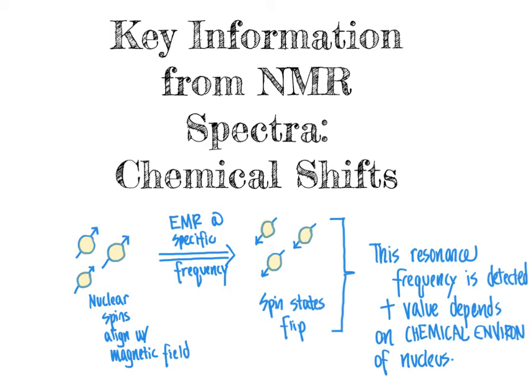In the last video, we introduced the topic of NMR spectroscopy, a key tool in our kit of methods for determining the complete structures of organic molecules. As we continue on in this video, what we are going to focus on are chemical shifts. By the end of this video, you should be able to explain what exactly a chemical shift is and what features of a molecule are going to determine where a chemical shift resides in an NMR spectrum.